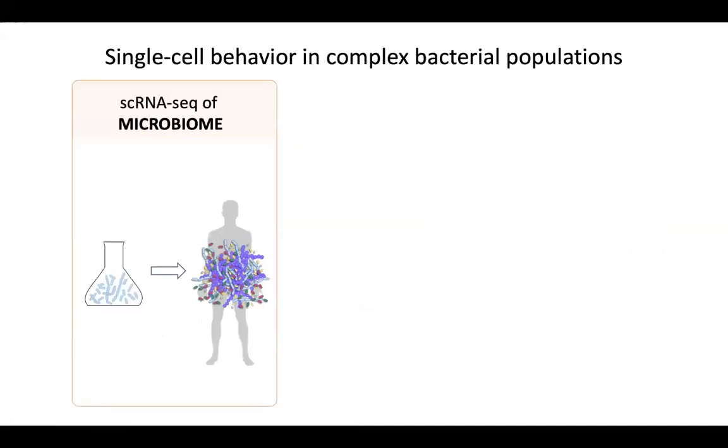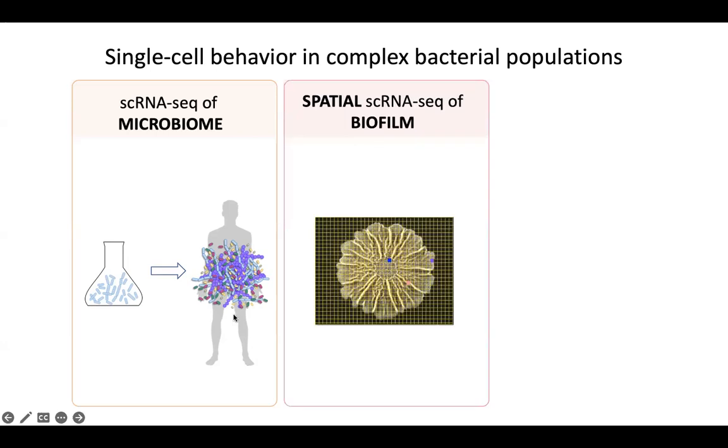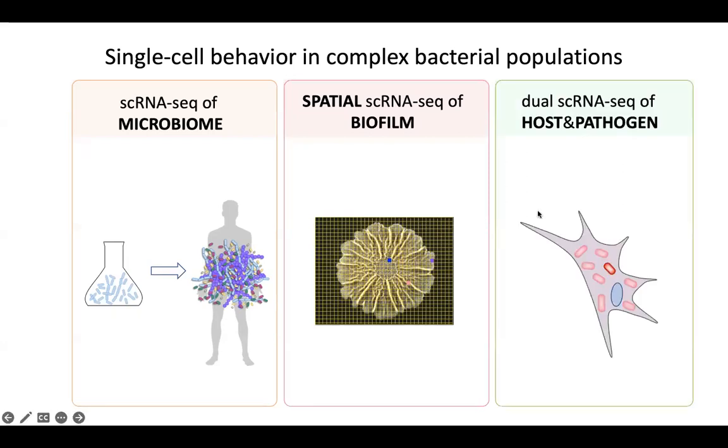So what we eventually want to do in the long term is to perform studies of single cell behavior in complex populations such as our microbiota, or perform spatial single cell RNA sequencing of a bacterial biofilm, or perform dual single cell RNA sequencing of a system that has fascinated me for quite some time, where we have a host eukaryotic cell and an intracellular pathogen.